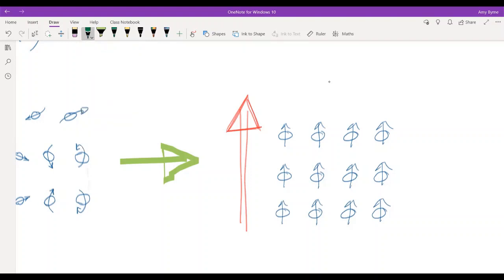Part of that is they are sending radio waves. And those radio waves, depending on what that hydrogen is bonded to, have the energy to flip that hydrogen, so it is going against the stream.